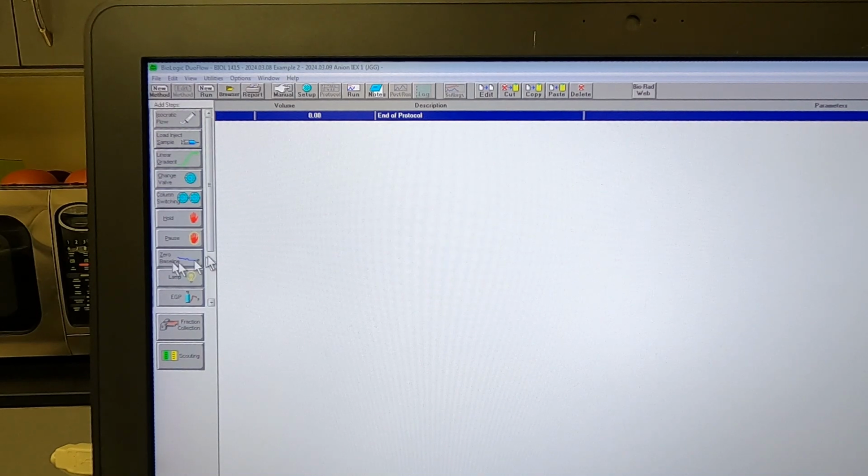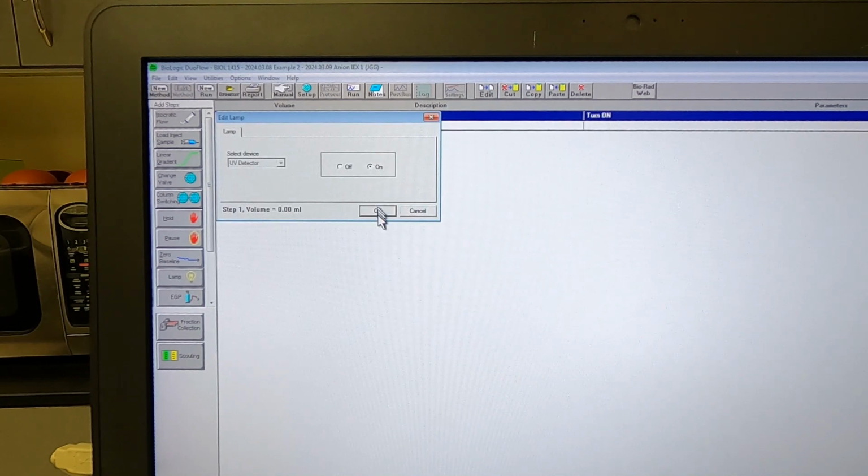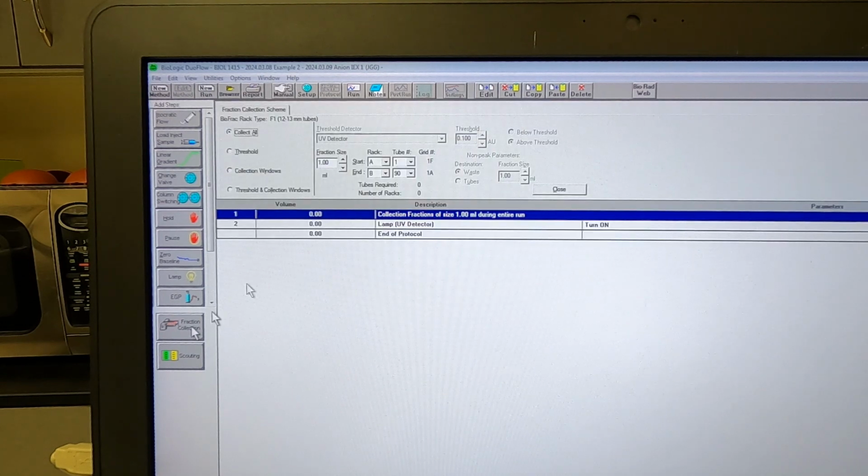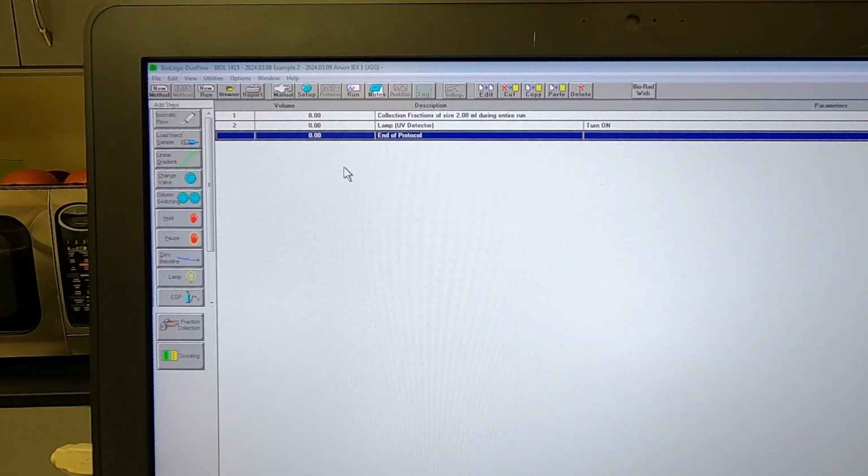Zero baseline. So again, this is just a blank UV detector. There's a lamp control, so we can insert a command to, for instance, turn the lamp on, which I like to do at the beginning of every method. That's just to make sure that if it was inadvertently turned off, when we start our purification, it will make sure to turn it on. And then here is our fraction collection command line, which we'll also add at the beginning. So we're going to just collect all of our fractions, and then we're going to tell it that we want 2 milliliter fraction sizes.